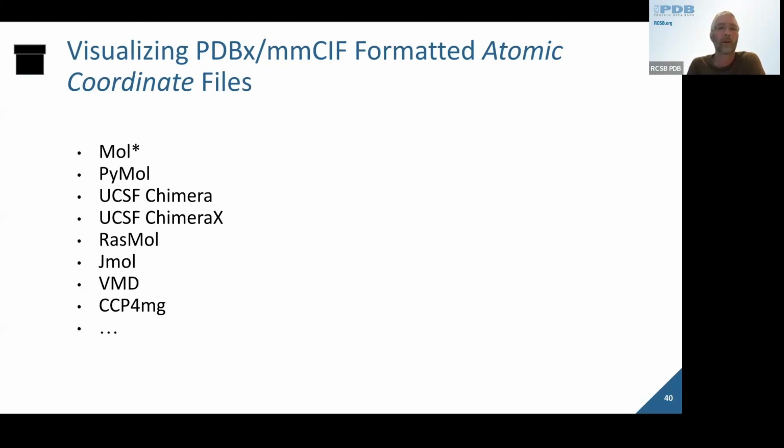And I'll go ahead and start here by just giving you what is essentially a partial list of major visualization programs that in fact read PDBx mmCIF files and have read these files for quite a long time. So if you've produced a PDBx mmCIF formatted atomic coordinate file, you will be able to find a place to visualize it.